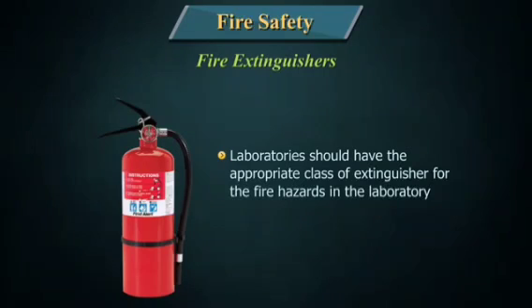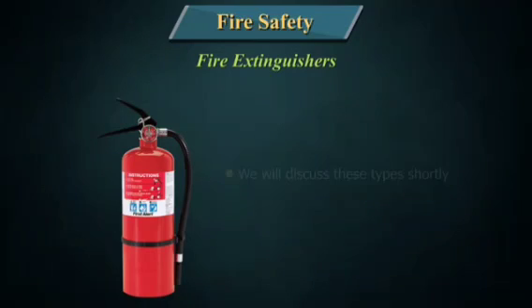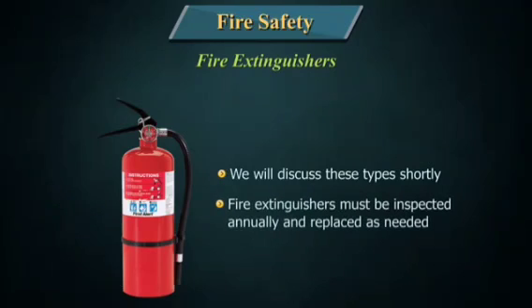Laboratories should have the appropriate class of extinguisher for the fire hazards in the laboratory. In general, a Class BC or Class ABC extinguisher is appropriate. We will discuss these types shortly. Fire extinguishers must be inspected annually and replaced as needed.